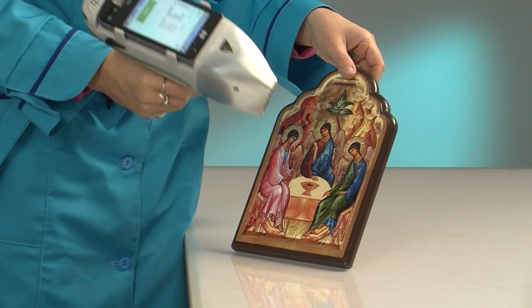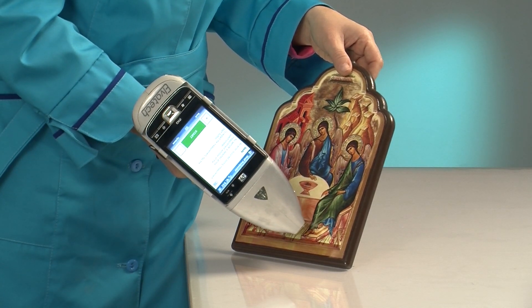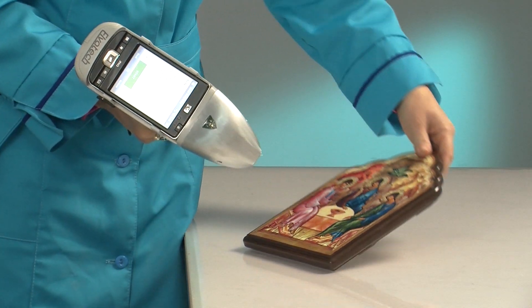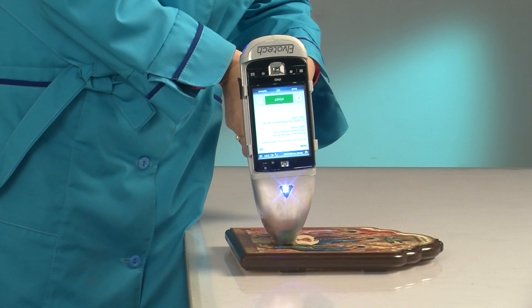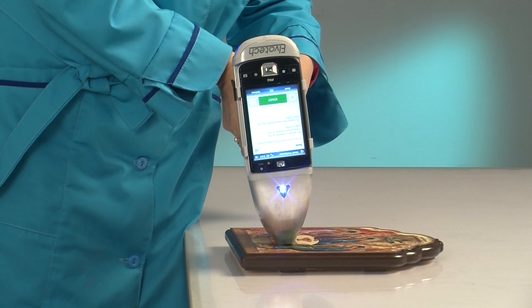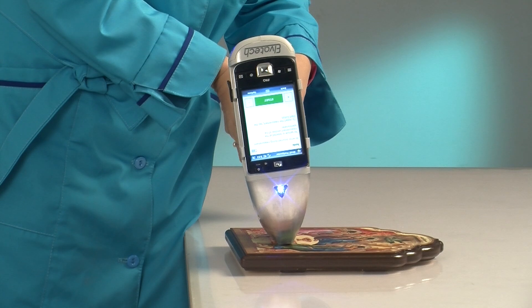The measuring process is very simple and takes mere seconds. Place the instrument against the sample and pull the trigger, and the next moment you have the complete elemental composition, which can be further downloaded onto a computer for a more detailed analysis or printing.